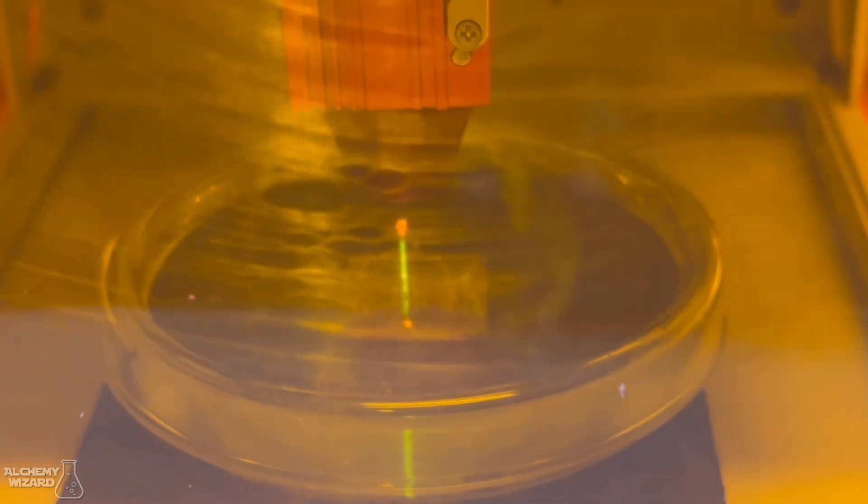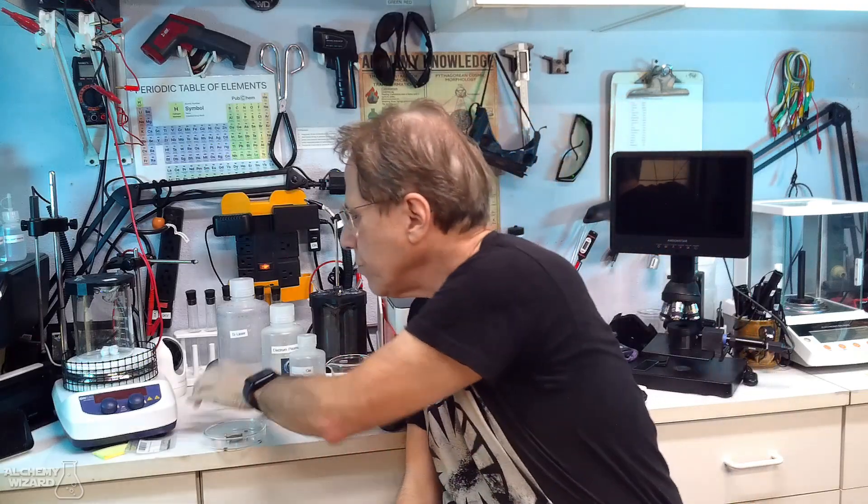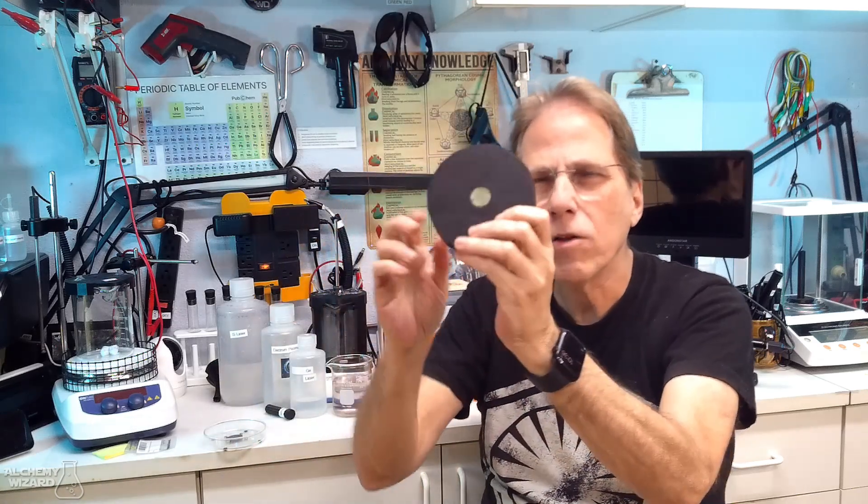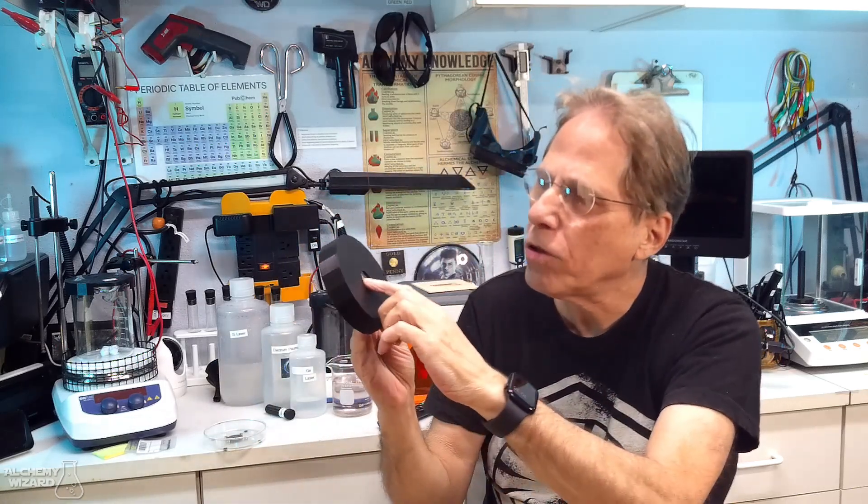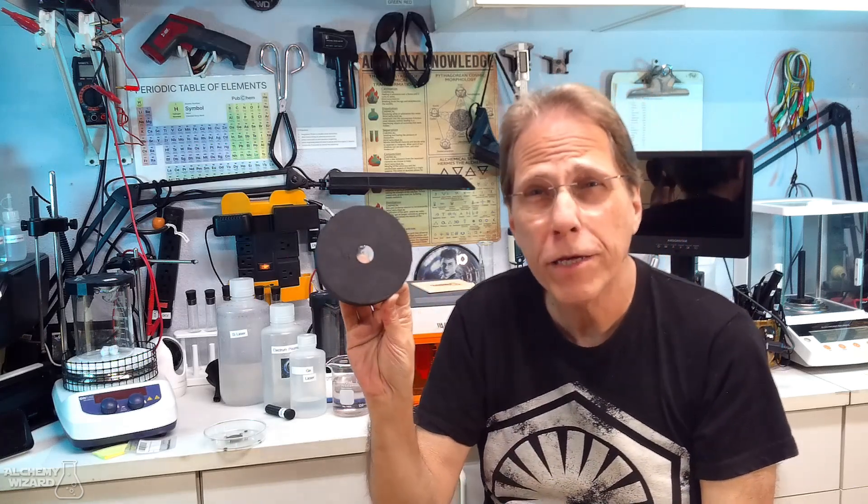It also helps us with the laser too to a certain extent, and I'll talk about that in a minute. And what you do is you take the petri dish cover and you put it in here like this. It has a little hole on the top and the little hole is to allow the laser to go through.